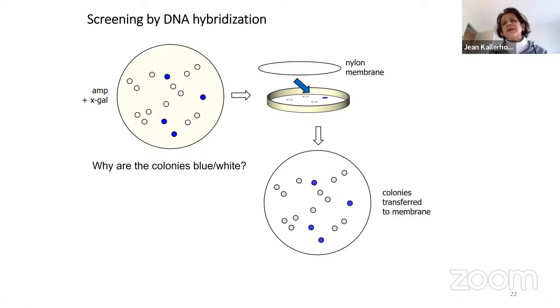Do you understand? Okay, I understand. Thank you. We have to make two Petri dishes. When we have this, we take this one, we put it on another Petri dish. This means we order the colonies.